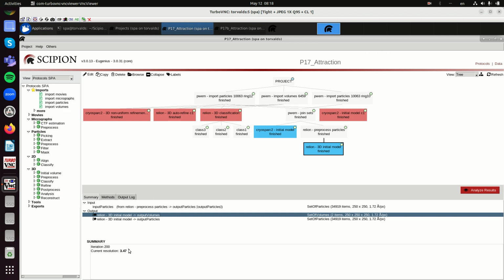Never trust these Fourier shell correlation resolutions blindly, because they measure consistency. If I make systematic mistakes and compare two structures with the same systematic mistakes, they will correlate pretty well up to very high resolution. This is not a particular criticism of RELION or CryoSPARC. It is not that CryoSPARC is better than RELION or the opposite, but algorithms, depending on the specific runs, may converge to different points, and you have to pay attention to which point you have converged. And we have this problem of attraction: once a direction starts getting signal-to-noise ratio, it attracts things around.